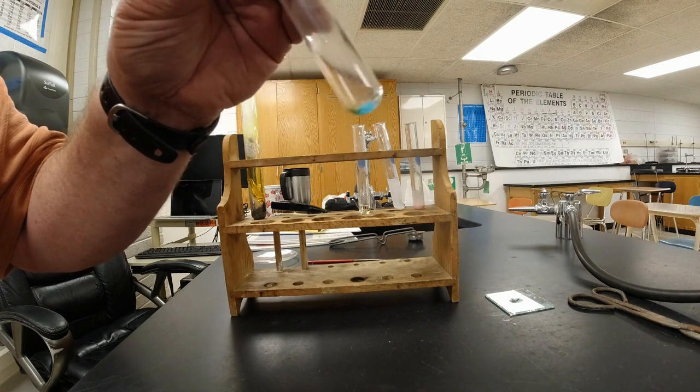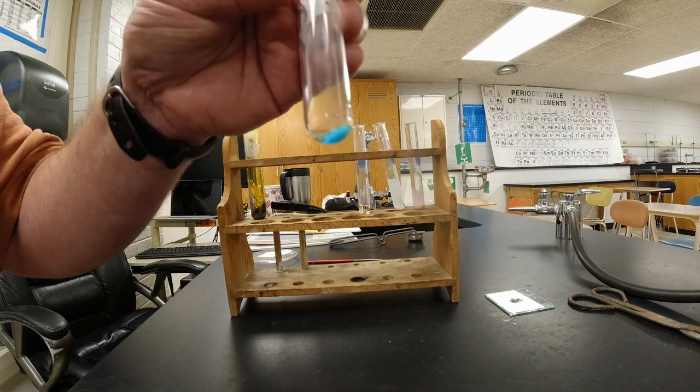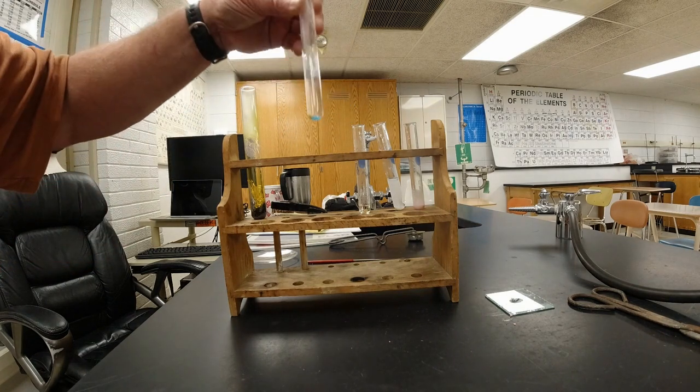So we actually had two things going on here. We drove the water off using heat, and then we added the water back on. It stuck to the crystals, and it turned into a new substance, the blue crystal.